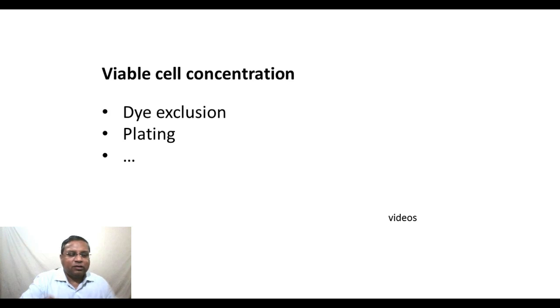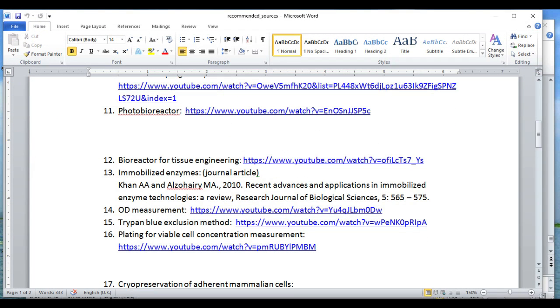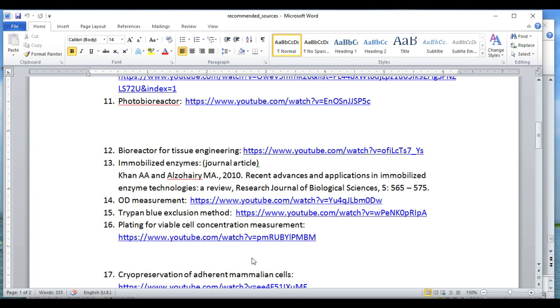The videos here, let me show you the details of the videos. You may want to look at them. The number 15 is for the trypan blue exclusion method and 16 for plating for viable cell concentration measurement. These are nice videos that you can look at for the details of the measurement.